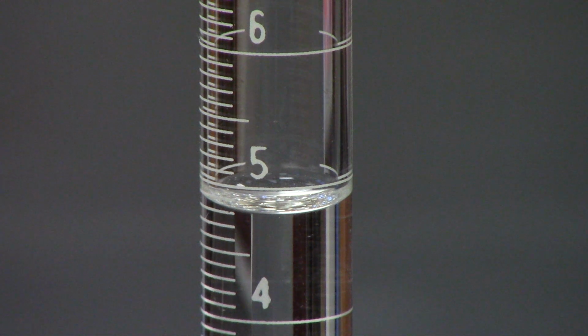Okay, so those are the 2 experiments. And then what you have to do with this is divide the mass by its volume. Okay, so just take the 3.63 and divide it by 4.90, and you come up with a number. And that number you're going to go to the hundredths. So your answer is going to be some 0.71 or something like that. I don't know what it is. I don't know what your calculations will be. But that's what you have to put in your lab book or record.